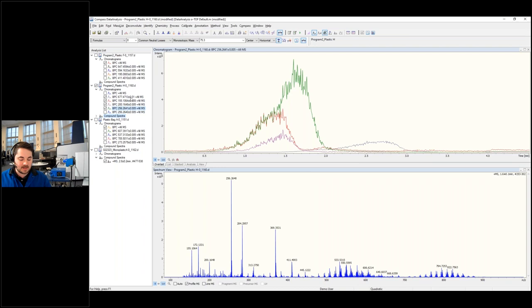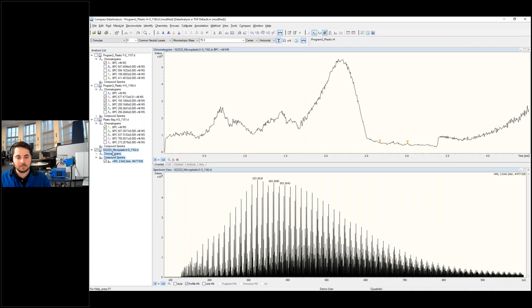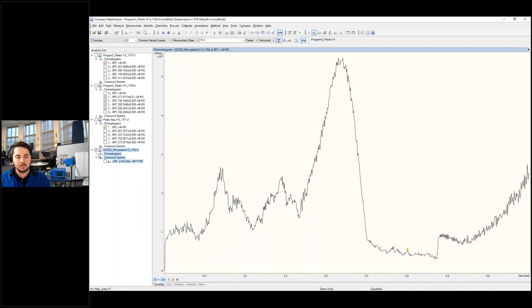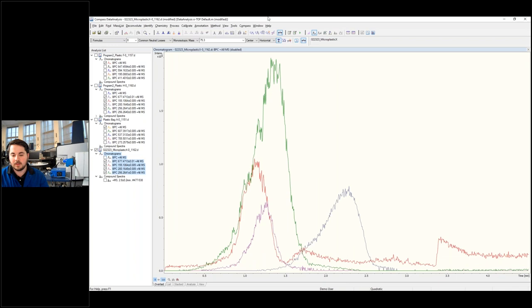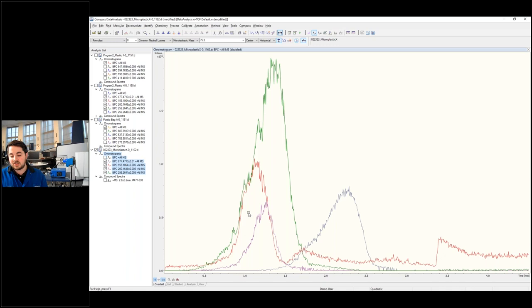So from here, let's go ahead and copy these chromatograms and apply it to our unknown. Let me uncheck that so we can get a full view of it and paste. So we're seeing the same four base peak chromatograms that are present in the Plastic H, which is the trash bag. And now we're seeing it in our unknown. So again, this is just going off four, but this is a good indication that these two samples are a positive ID of each other.